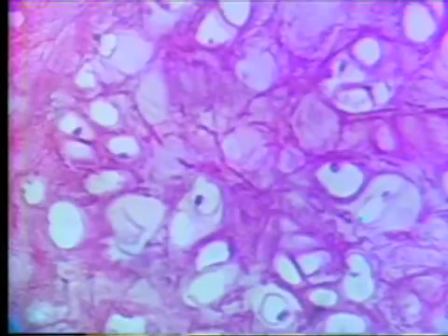Now we'll go to fibrous cartilage. Fibrous cartilage is just like dense, regular FECT. It appears like ligament and tendon, but there are cartilage cells present. Now, in the intervertebral disc, that's between the vertebral column, in the column itself, there's bones. There's also a connective tissue disc spanning the two bones.